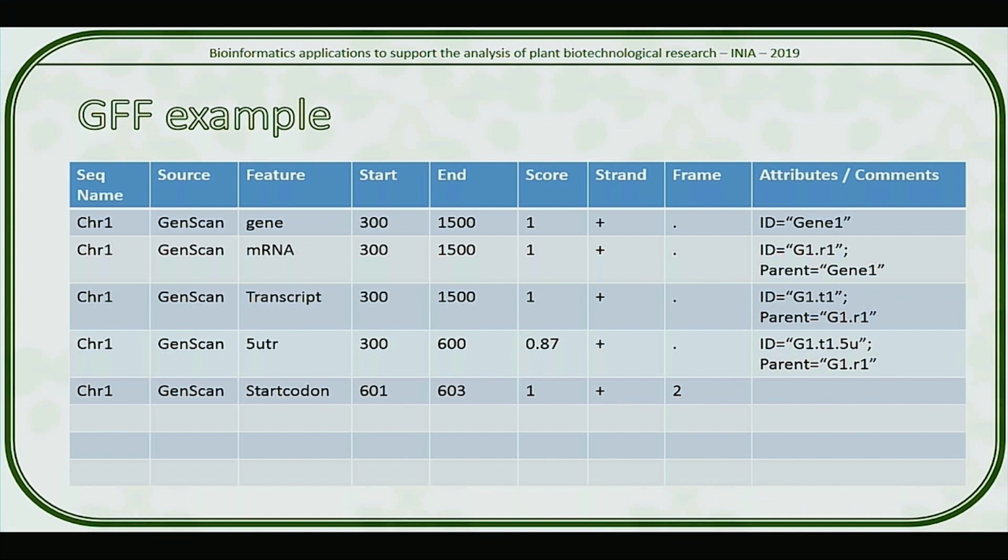There we go. In what strand it is. And this is important because the start and end are always, as I mentioned, going to be from the smallest to the biggest. That doesn't mean that that's the actual direction of the feature. It is just convention. The start has to be the lowest point and the end has to be the highest point. But this is the part that defines what strand I'm getting it from.